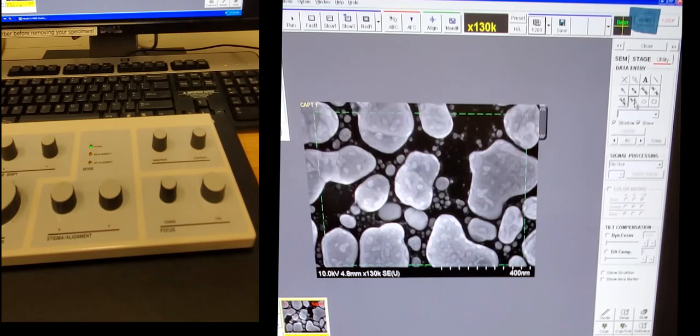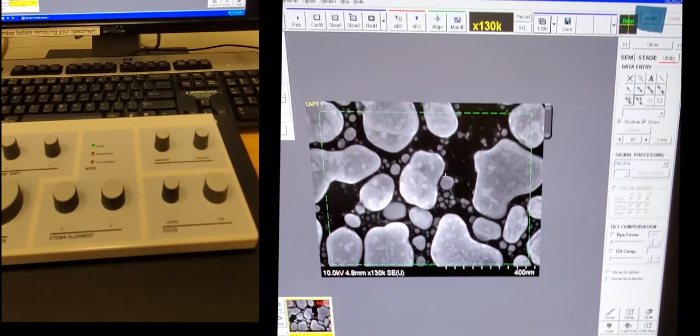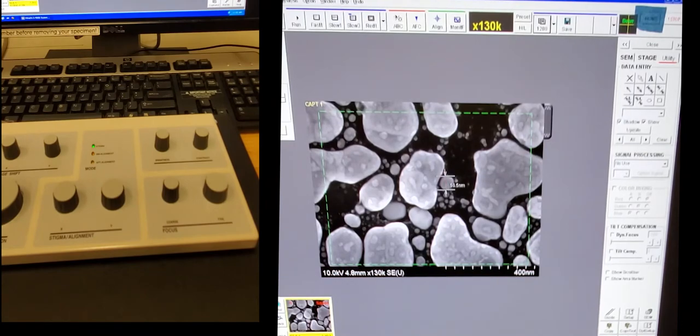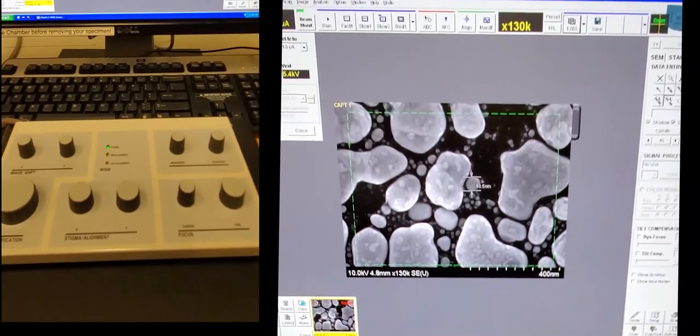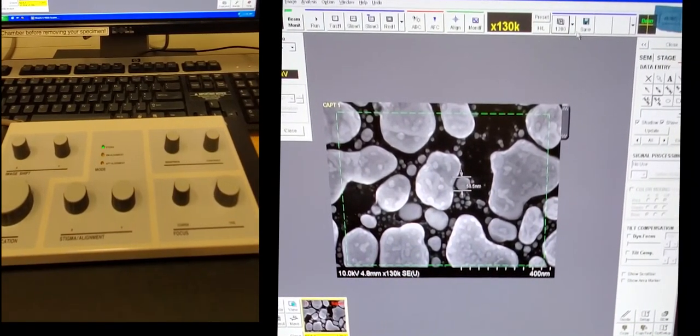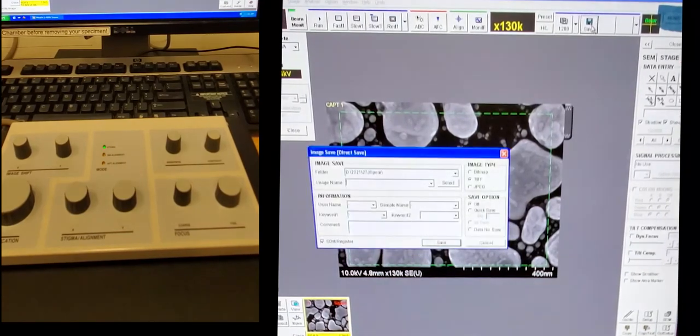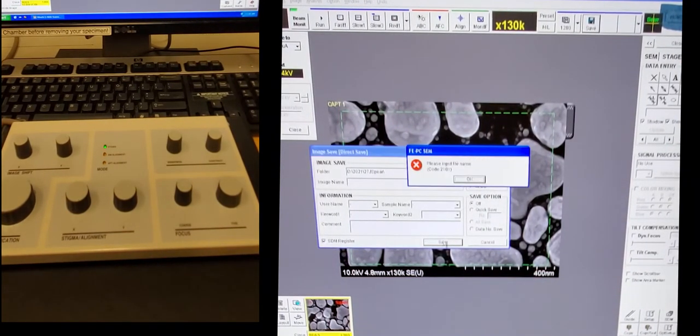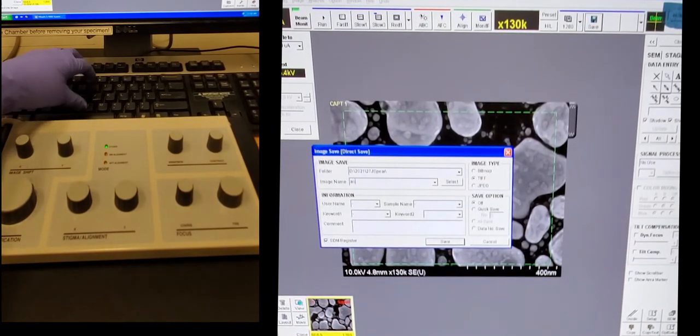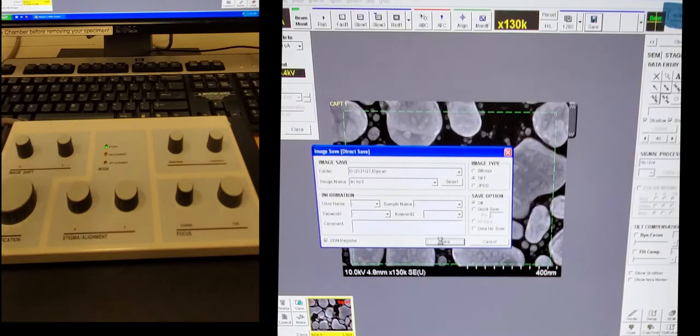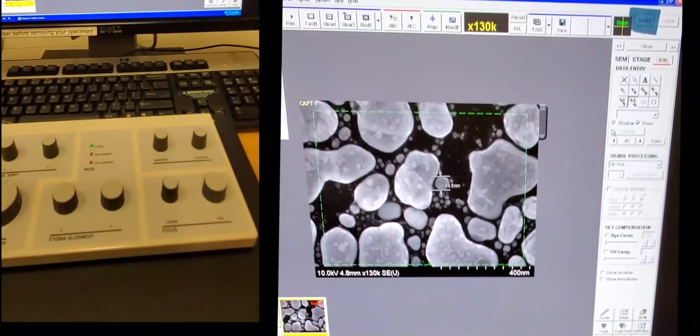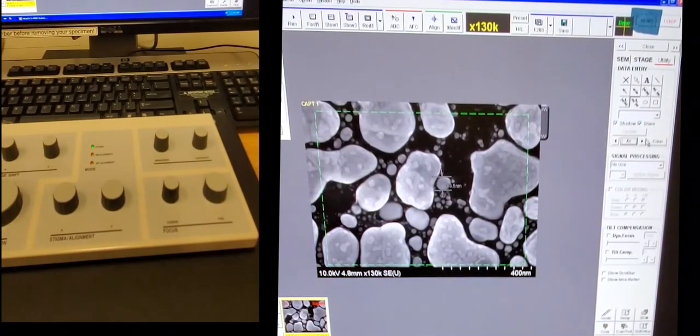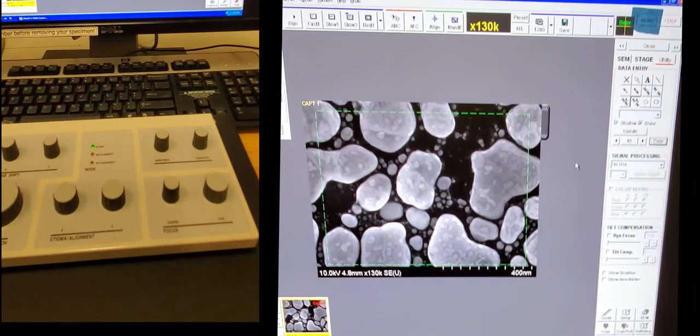If you want to do measurements, you can come to utility, click on the measure icon and then draw a line and it will give you a measurement if, for example, you want to measure the size of this particle. Now if you want to save that measurement, you would have to click the save at the top of the screen. And then it will actually let you save the image with the measurement on top of it. If you want to get rid of the measurement, you will click this highlight all and then clear. We'll remove the markers.